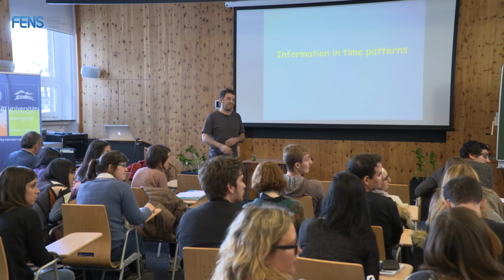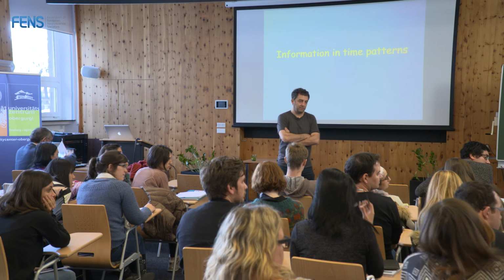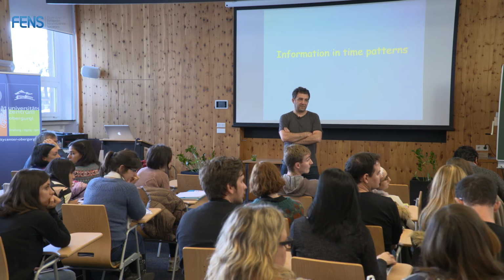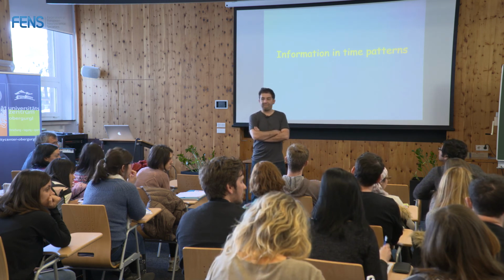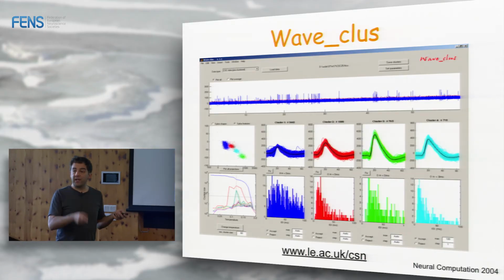So the test that we always apply is to see whether one of our supposed single neurons ever fires within about 2 or 3 milliseconds. And if it does, then it's not a single neuron, because of the refractory period. So that's a useful additional test to put in, which I'm sure you do, but it may be worth people knowing that it's really essential. So what Edmond is saying is very important.